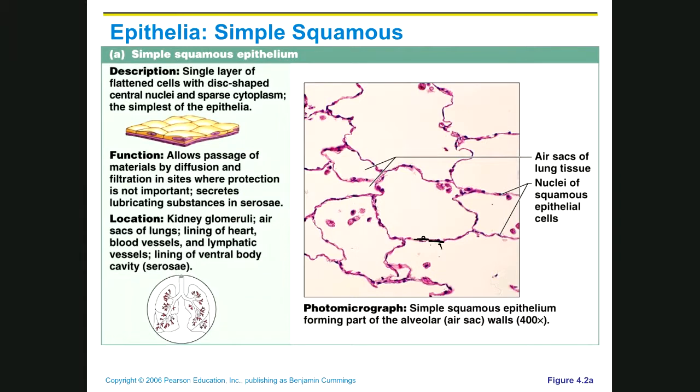And there's its nucleus. And so if you look at these cells, you can see just how thin and wide and flat they are. And so they're very, very thin. And so if you drew one from the side, it's like this, very thin. And then it's got that little disc-shaped nucleus. So again, they're going to be really good at doing diffusion. And along with diffusion, oxygen diffuses in one direction and carbon dioxide diffuses in the other direction. So it's going to diffuse across these membranes.